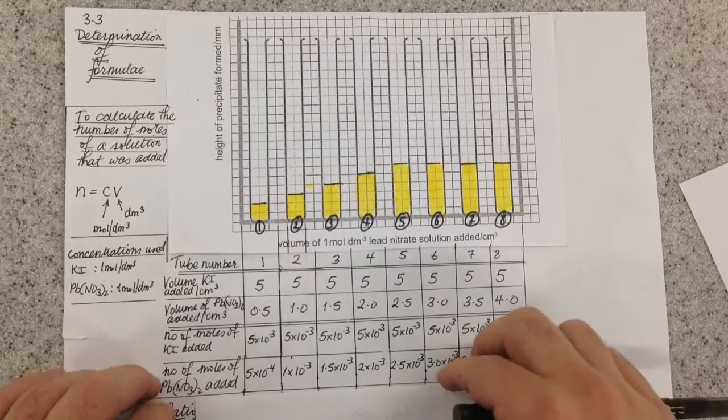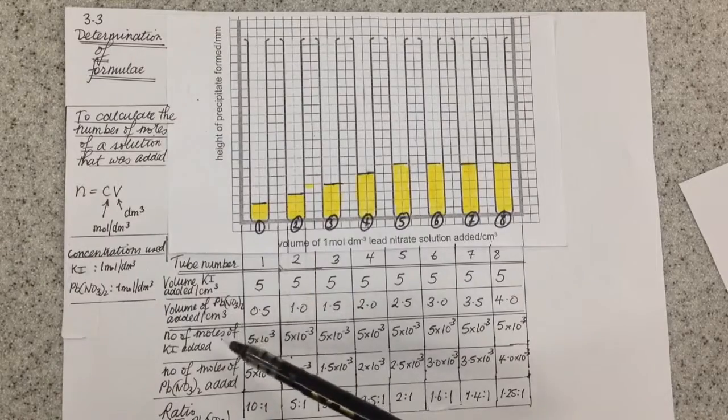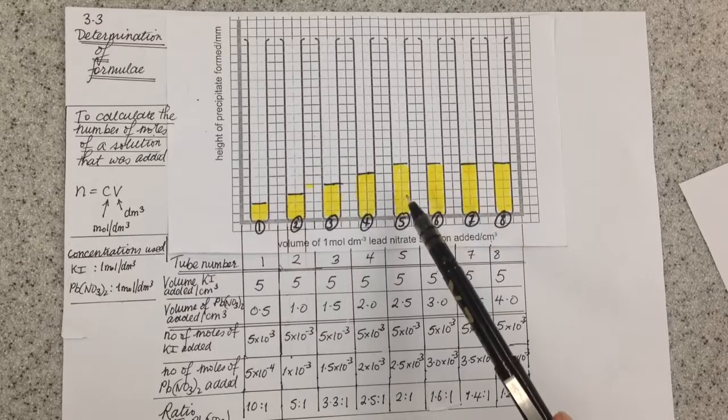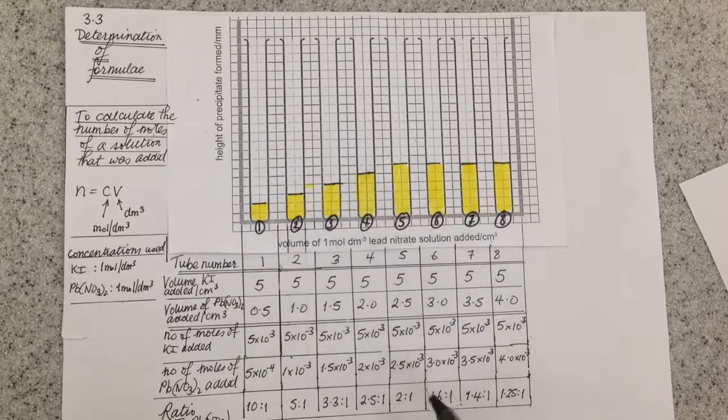What we then have to do is work out the ratio. So the ratio is simply the number of moles of potassium iodide compared with the number of moles of lead nitrate. So we divide and compare the ratio of that one to that one, that one to that one, that one to that one. And as you go across, what you find is that in tube 5, which is the last tube at which the amount of precipitate increases, the ratio is 2 to 1.